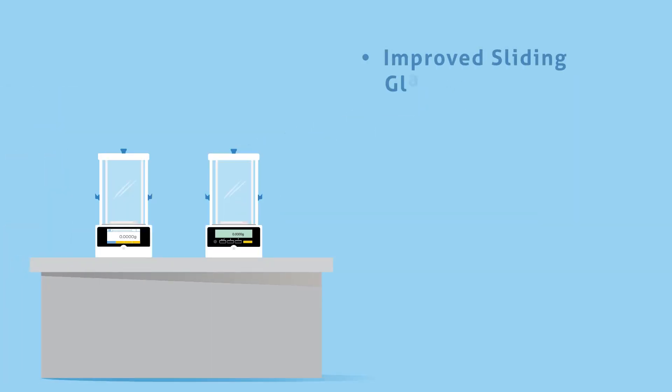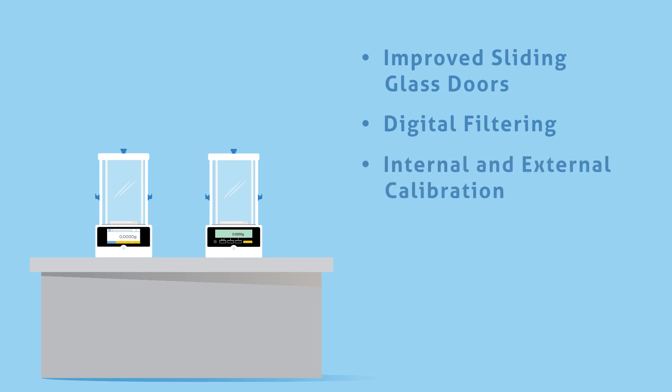Both ranges include improved draft shields with sliding glass doors. Selectable digital filtering decreases the effects of vibrations or disturbances. External calibration allows verification and adjustment with weights, while certain models offer internal calibration. Printouts include date and time, essential for data traceability and tracking within good laboratory practice guidelines.